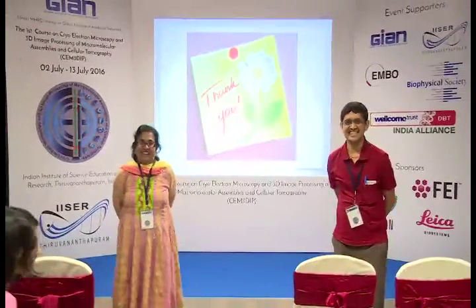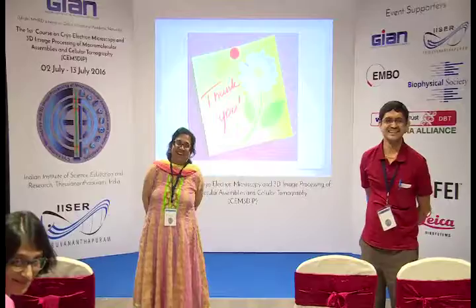Maybe you want to say anything on that? The question was, would you use it against negative stain? First answer would be, why not. Second answer would be, why do you need negative stain?